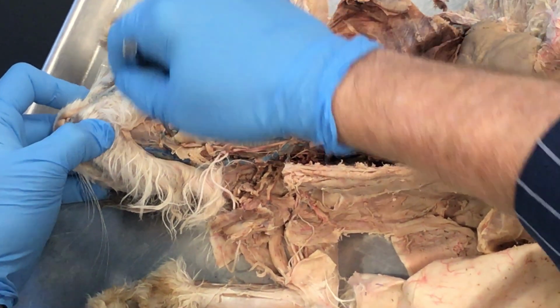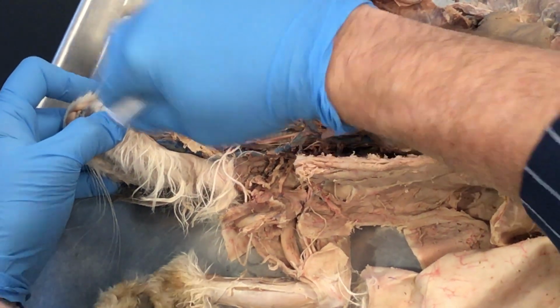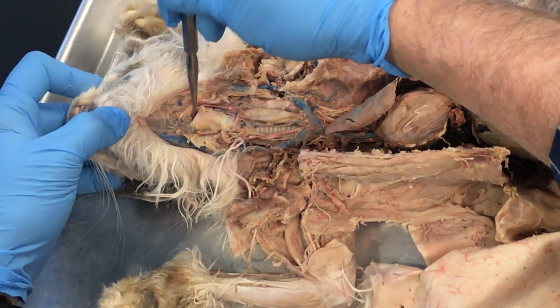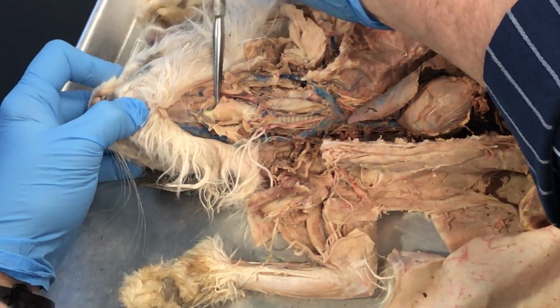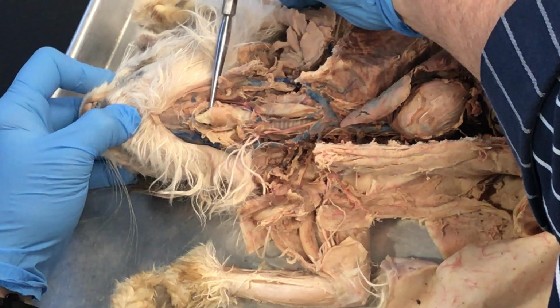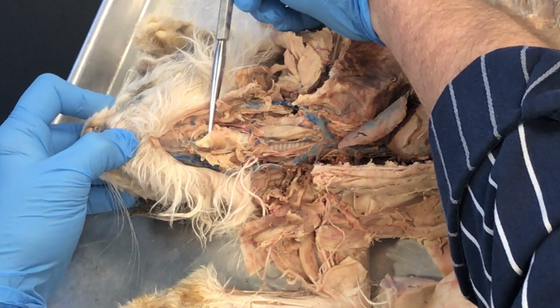So what I did very quickly on the Tuesday group was I simply grabbed the scissors, stuck them in here, reverse scissor technique, opened this area up, and you'll see now when I pull this back, there's a little flap, and that little flap right there, see the flap right there? That flap is the epiglottis, okay?